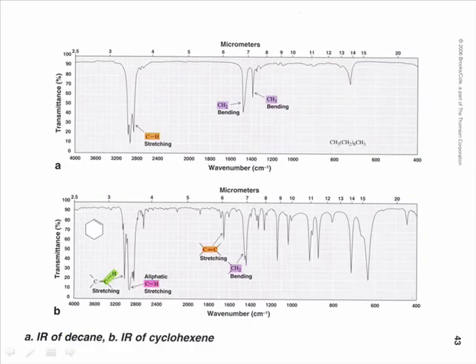Let's look at some more groups. If you look at decane here, decane is a simple alkane, and so its IR spectrum is relatively simple. You notice that there is nothing above 3000, so these are all C sp3 H bonds. And here we have only a handful of other peaks, so our fingerprint region is actually relatively simple, which come from CH2 and CH3 vibrations as well.